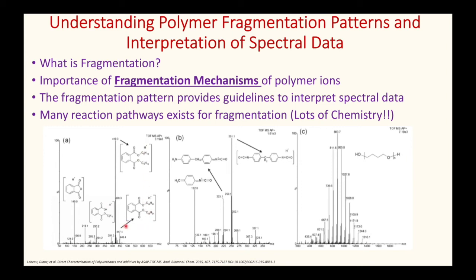The difference between these two spectral lines is the molecular mass that was lost during fragmentation. And if we go from this peak to this peak, we actually see this entire arm just disappears. The difference between the spectral lines, again, is going to equal that molecular formula that was lost during fragmentation. And that's just a simple way to understand what is happening.